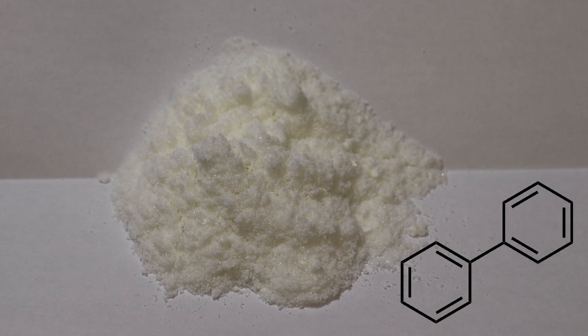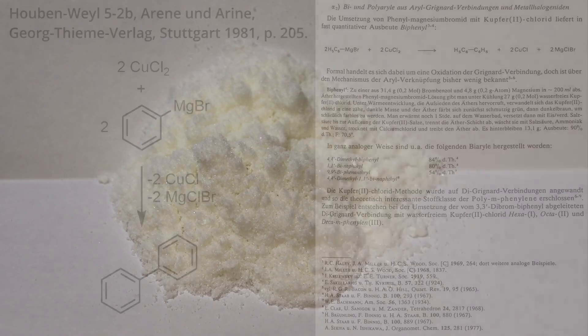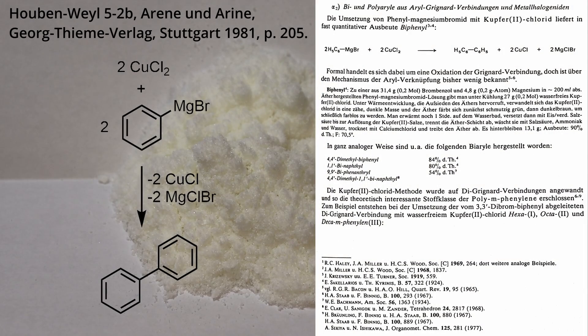Biphenyl is a pleasant smelling aromatic hydrocarbon which finds wide use as a building block in organic chemistry. In the laboratory it can be made by the coupling of phenyl magnesium bromide with copper chloride as seen in this procedure.